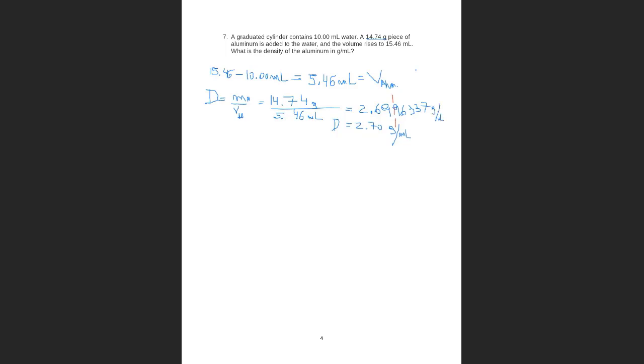And that will be the correct number of sig figs, because the calculator will give you so many. So we need to be careful with that. Yes. I guess with practice, for now, we are good. And I would like to go back to the last part of the report to make sure that you will know what to do when you get there. This will help you, I think, with the quiz, all this practice.